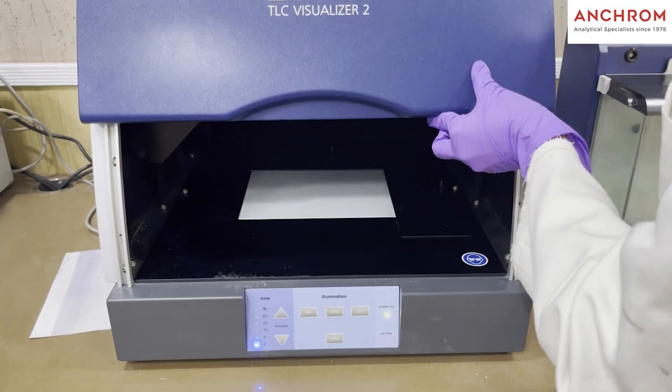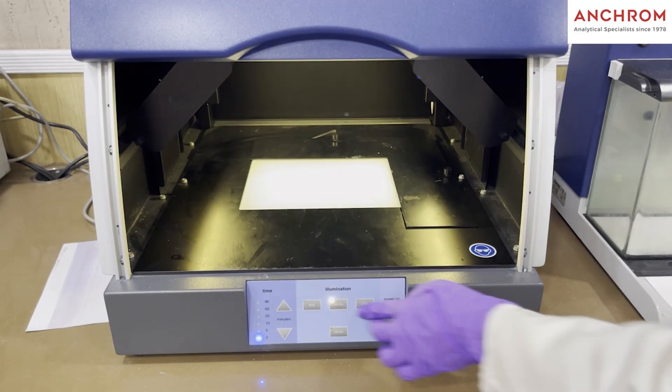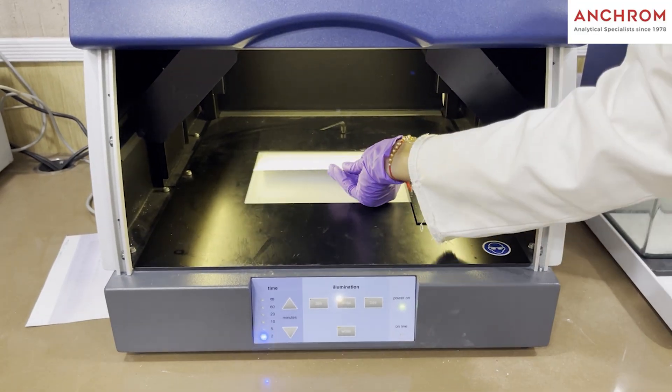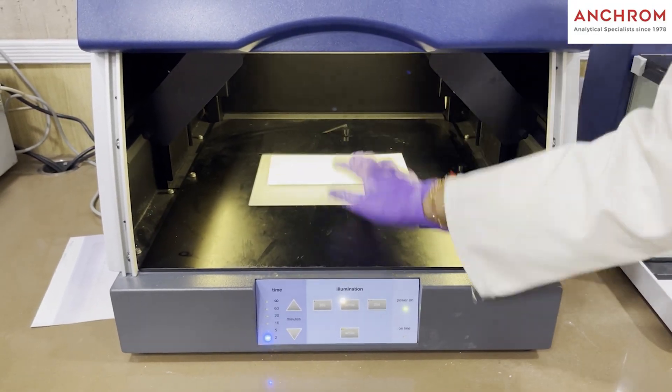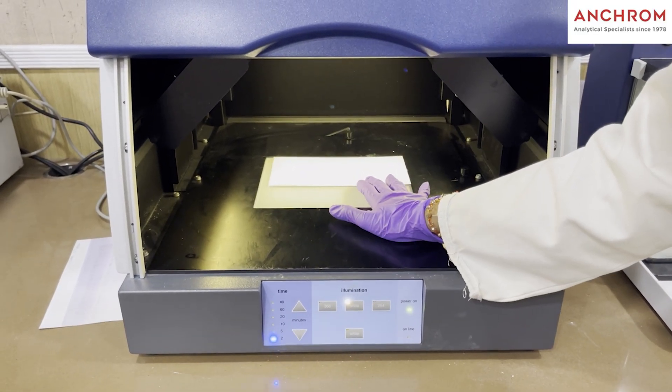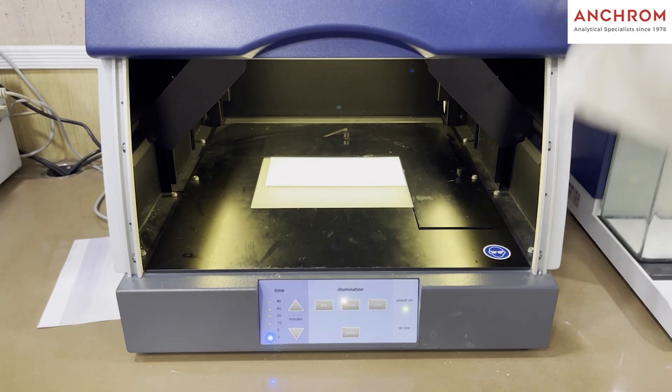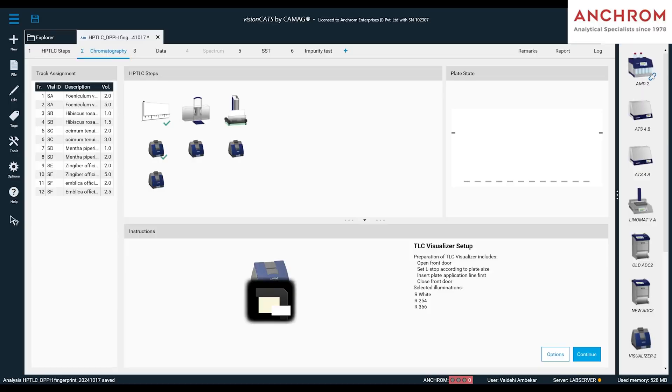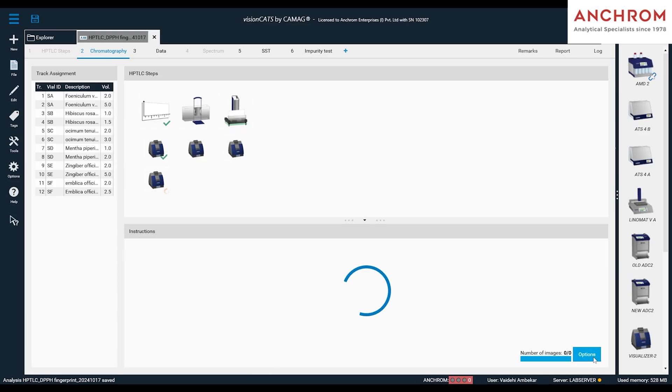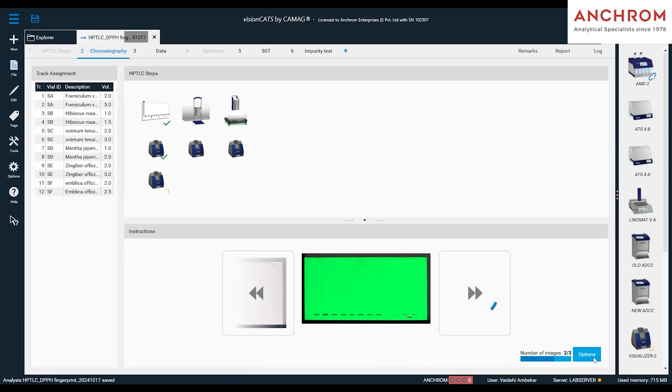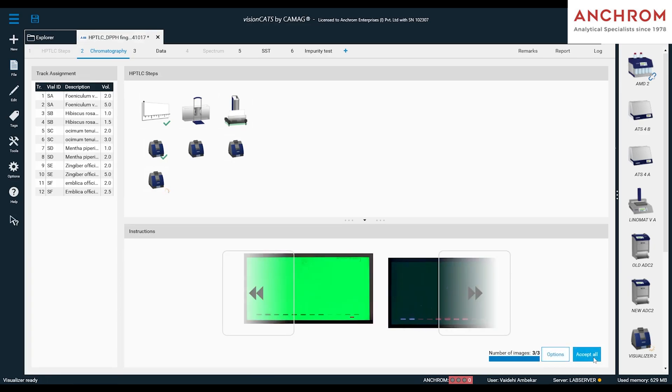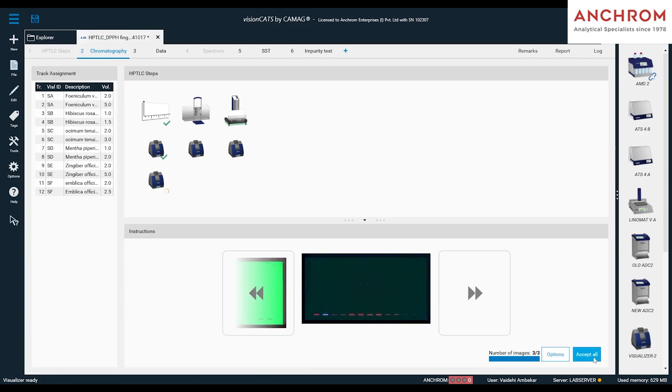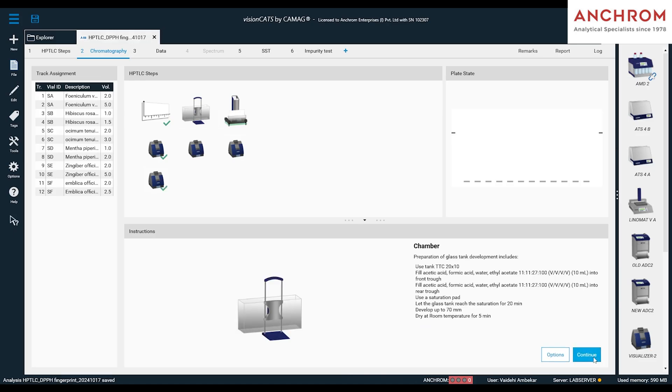After the sample application, we will again place the plate in the Visualizer 2 to capture the applied plate image. So, in the software, we will click on continue and the applied plate image will be captured. Once the images are captured, we will click on accept.